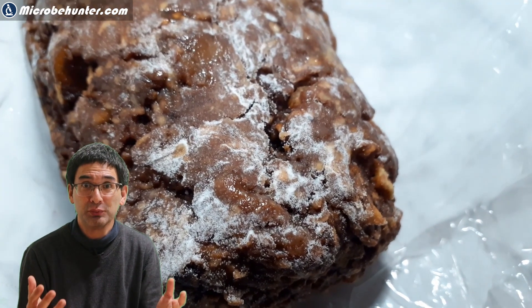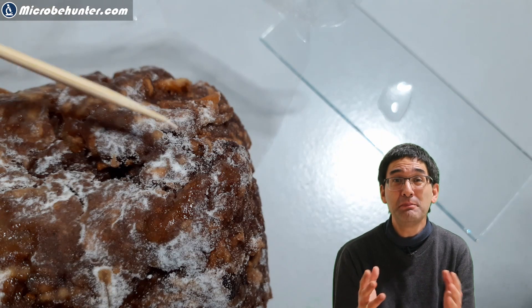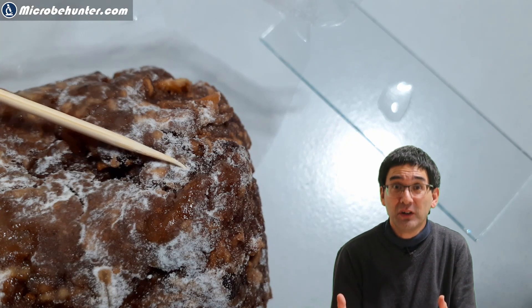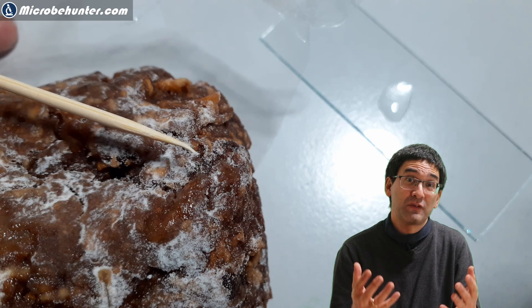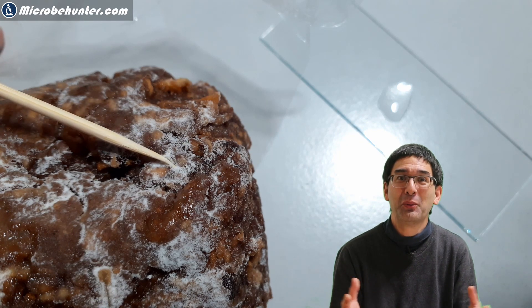Because I did not make the bread myself — it was a present after all — I'm a little bit suspicious. So could it be that the bread is moldy? Is this a fungus growing on the bread, or could it be just flour? Well, it's time to find out and I want to put the white stuff under my microscope.